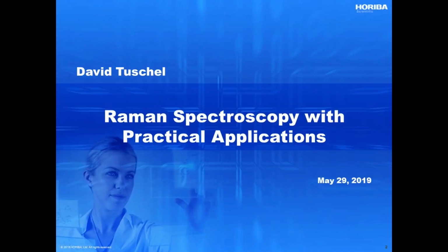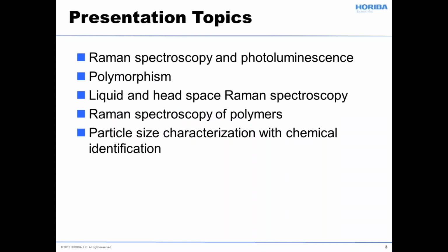Today we're going to talk about Raman spectroscopy with some practical applications. So it's going to be a little bit of an introductory survey, if you will, to Raman spectroscopy as applied to different kinds of materials. And behind those materials, if you will, are the applications, which I'd like you to be thinking about.